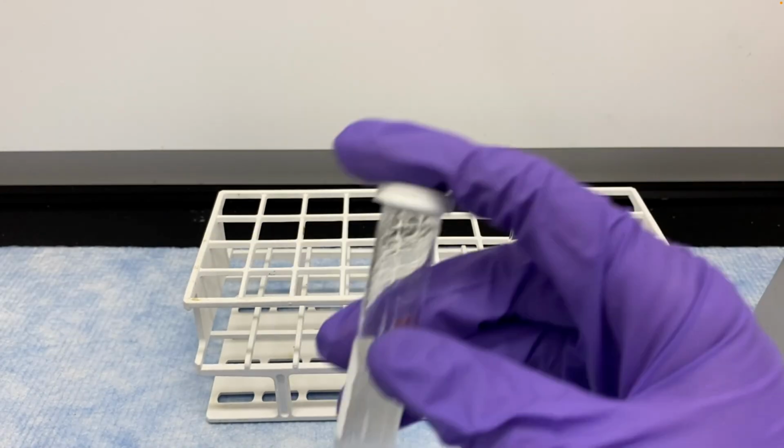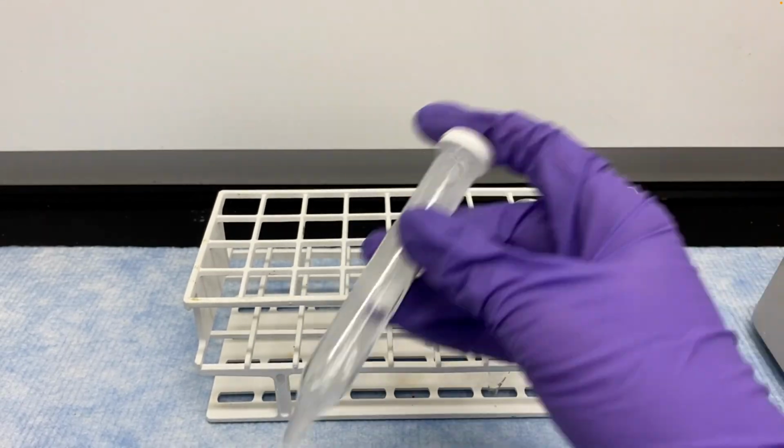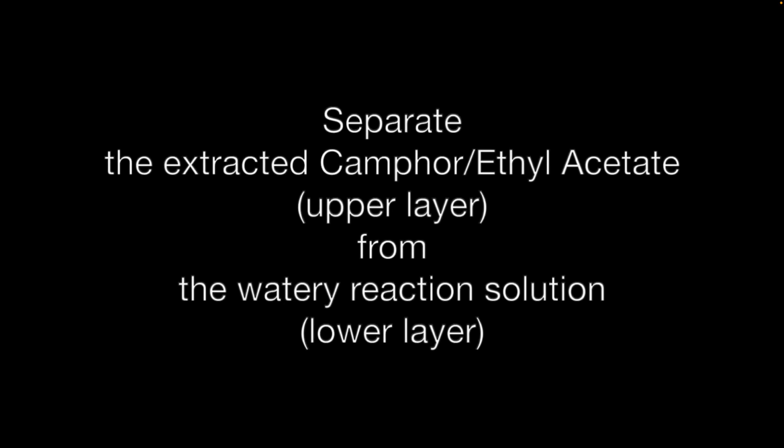When you do this extraction, you want to make sure you close the centrifuge tube, and then you shake the liquids up. That helps the water to mix with the ethyl acetate. Anywhere where camphor is will switch from being in the water to being in the ethyl acetate. As you shake these liquids up, though, they'll oftentimes evaporate a little bit, and pressure will build up in the container. So it's important that you open the lid every 30 seconds or so in order to release that pressure. If you don't open the lid when you do an extraction, the pressure can build up to the point where the container just bursts.